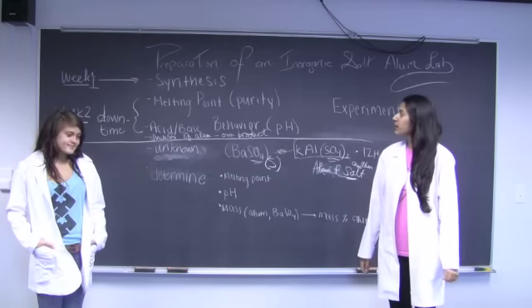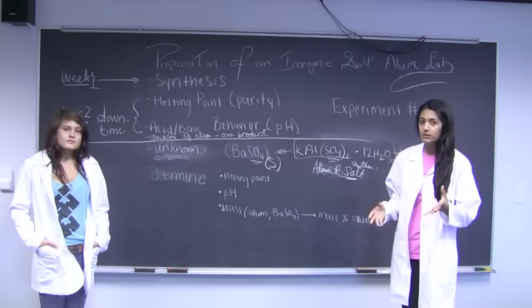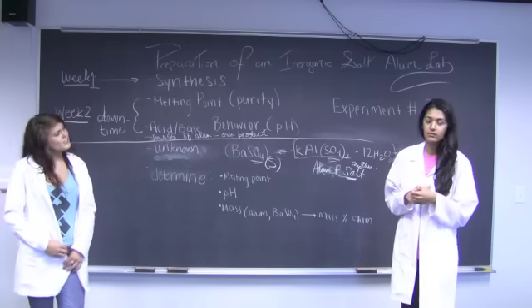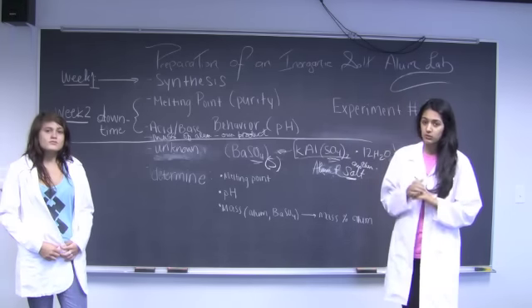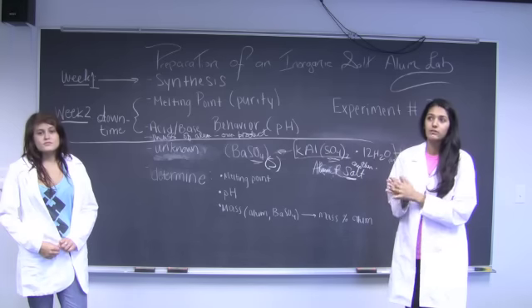Experiment number 2 is a preparation of alum, which is an inorganic salt. It's a double salt because it contains potassium and aluminum. In the first week, we'll be doing the synthesis of alum. What is synthesis? Synthesis is a process that goes from reactants to products through several reactions or just one reaction. In this lab, we'll be going through several steps to get to our final product.